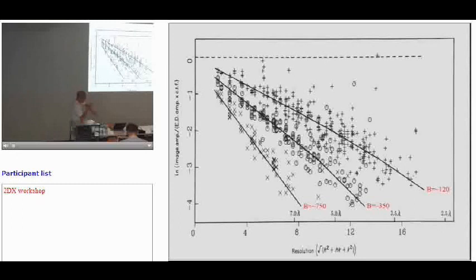So we have actually, and this is the last thing I was going to say, we've tried working on ways of imaging 2D crystals and single particles. But now we think we understand one of the problems with why it's so bad. And basically it's when you put the beam on, you create radiation damage. There is a bit of fading of the spots due to that. But mainly things move around.